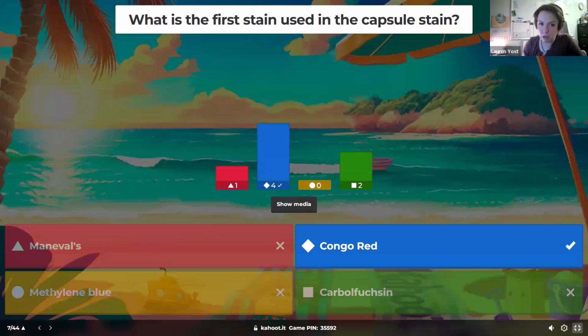If that's a pure culture, cells don't have rod and circle shapes. A pure culture means it's one bacterial species, and I shouldn't have to remind you of that. So if it's a pure culture of one bacterial species and you're seeing a bunch of rods and a bunch of clearly defined little circles, even if you can barely tell that they're greenish inside, that should be a hint to you that there are endospores in that sample.